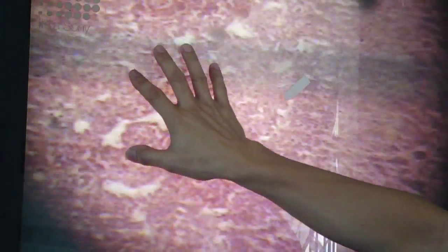The next specimen is your adrenal gland. So your adrenal gland is made up of the capsule on one side and the capsule on the other side. That is a transverse section. So this would be the adrenal cortex here. In the middle will be the adrenal medulla. On the other side will be another adrenal cortex.